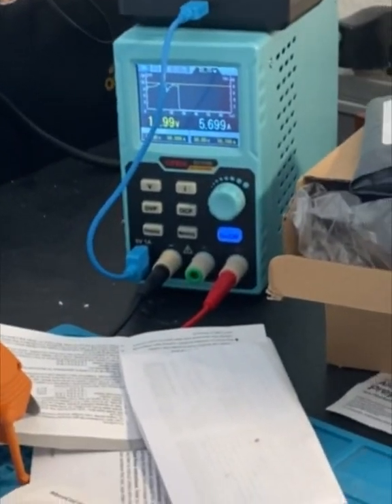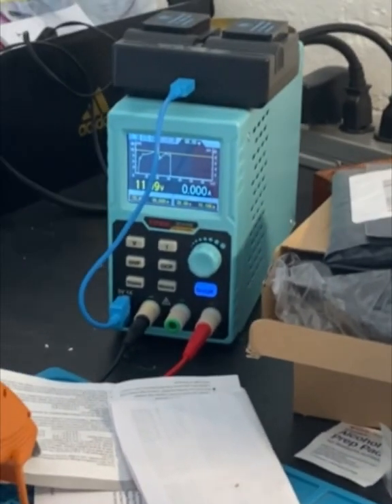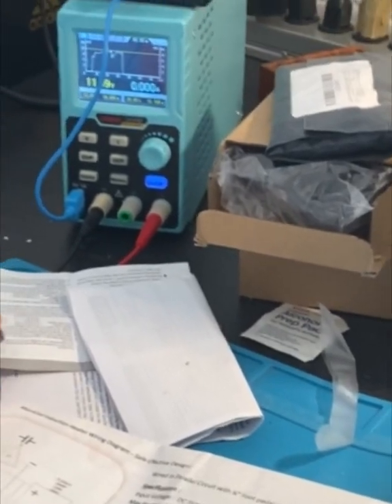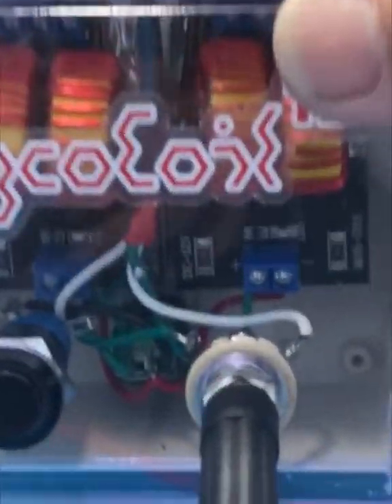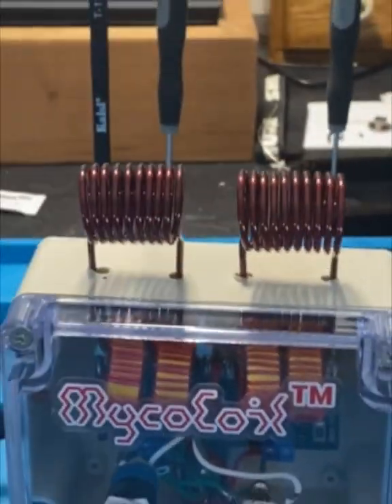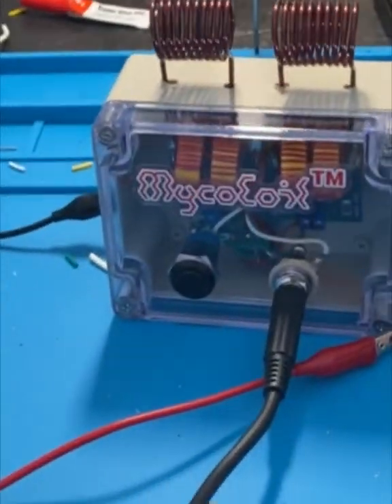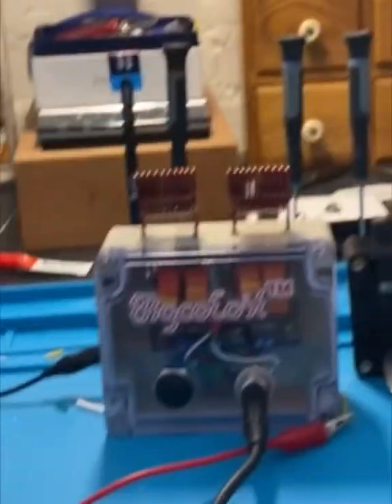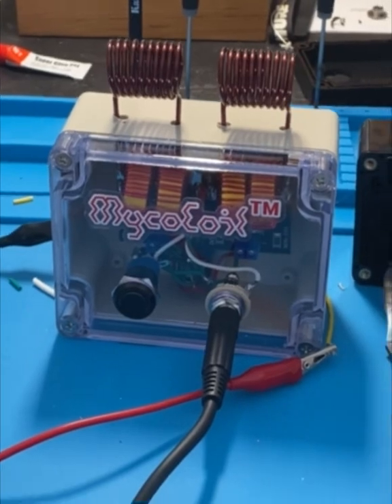I can mess around with different voltages and amperages to see what will be ideal. We're going to dial this in and make sure we use the right power supply. The YM power supply is pretty great — it's clean and comes in a bigger style box. Pretty cool — micro coil USA.